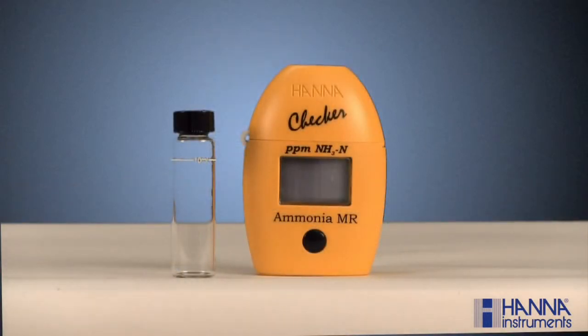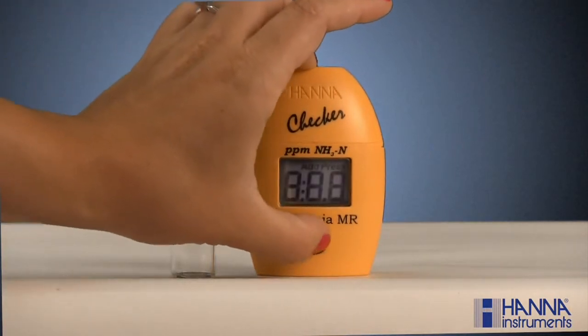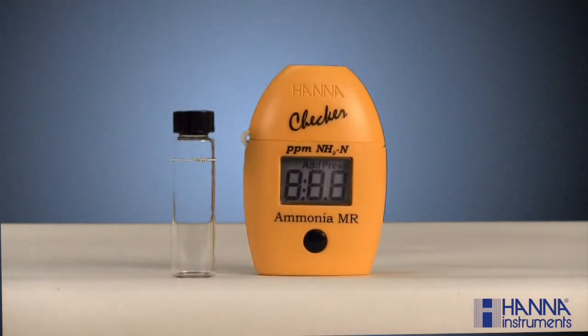Analyzing a sample with one of our Hanna checkers is fast and easy. First, turn the checker on by pressing the button. After all the segments are displayed, C1 and the word "add" will appear on the screen, with "press" blinking in the upper right-hand corner.